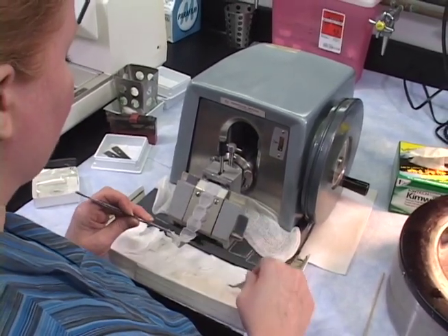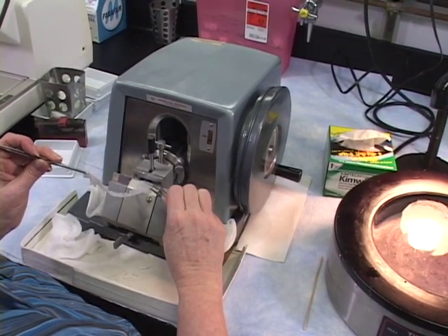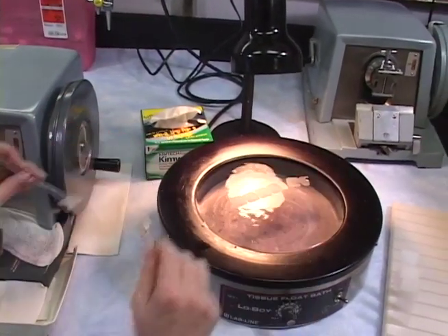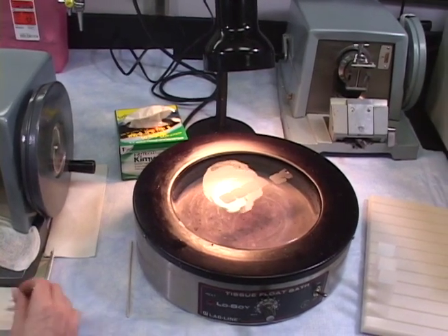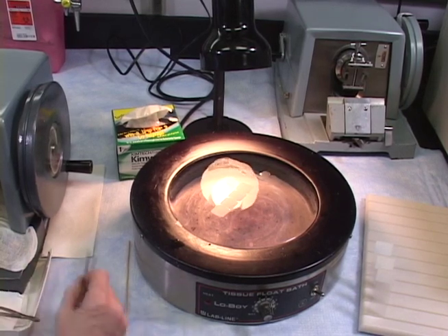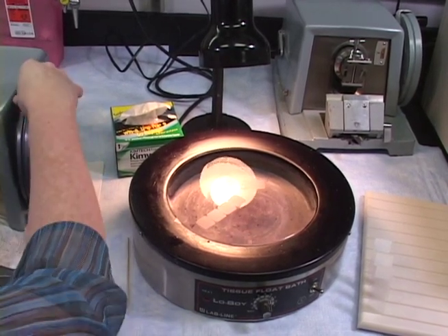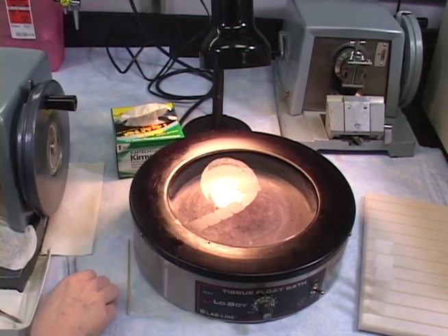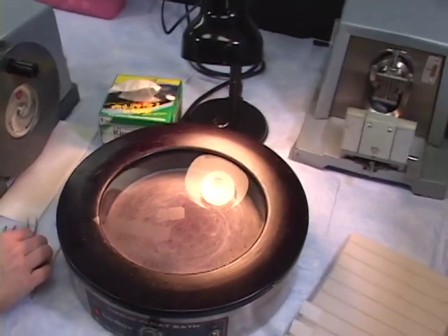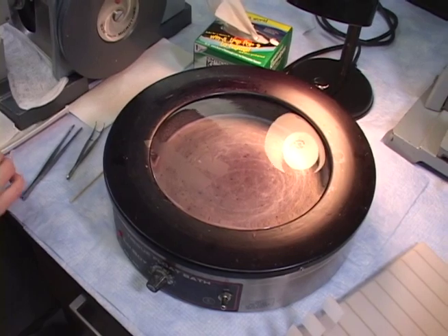Now, if you didn't like the stick method, you can use forceps too. I think it tends to slip a little bit out of the forceps doing it that way, but you can do it. Use 2 forceps to bring the ribbon over. And again, I wouldn't do more than 5 or 6 sections at a time, for the very reason that you're probably going to lose them because we have an air current with the ventilation here. Again, I'm going to lock this as I'm dealing with my ribbons, and I'm going to separate. I'm going to get my slide and then slowly pick up the ribbons. But we've already done that, so I'm just going to swipe them and discard those. That was just for practice.